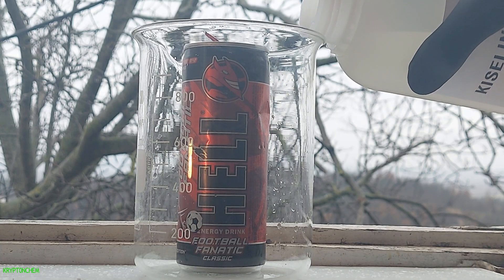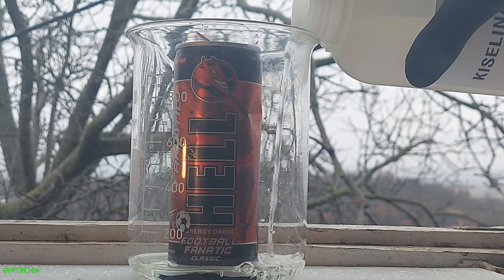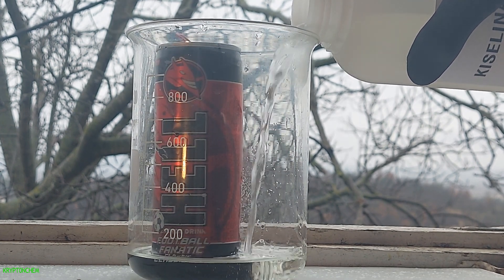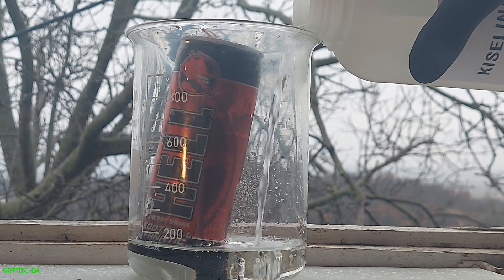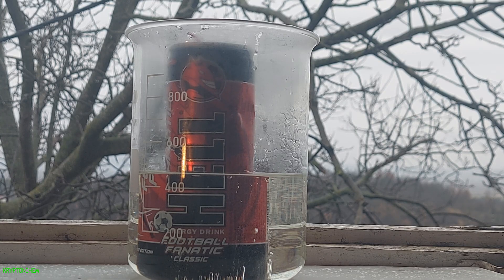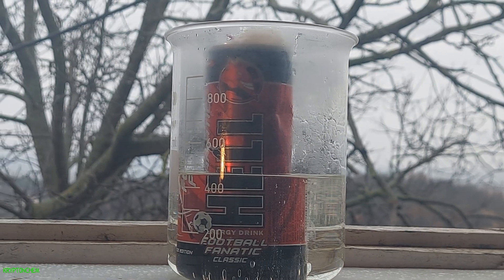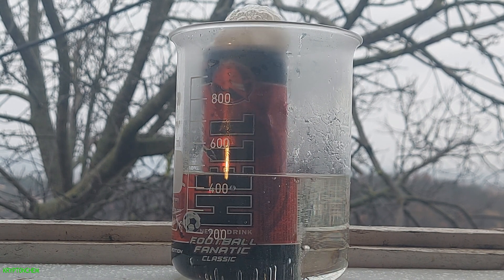To begin, I dropped this aluminium can in a 1000ml beaker and added a pretty decent amount of hydrochloric acid. After a few minutes the two started to react.